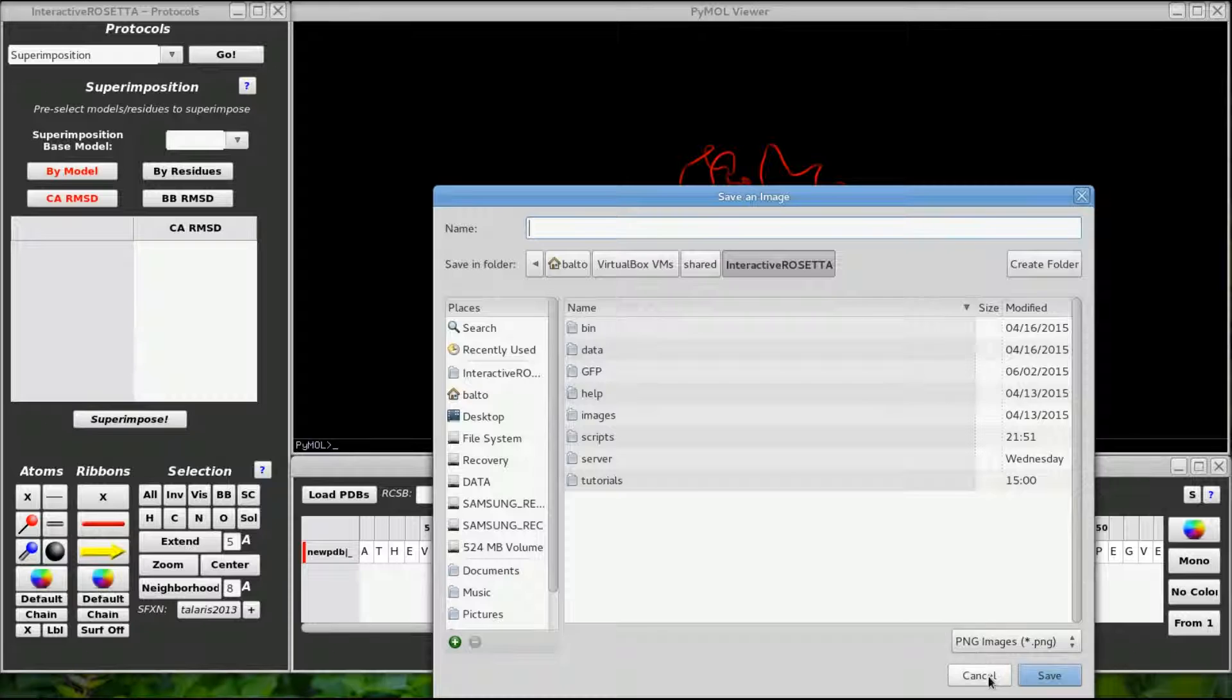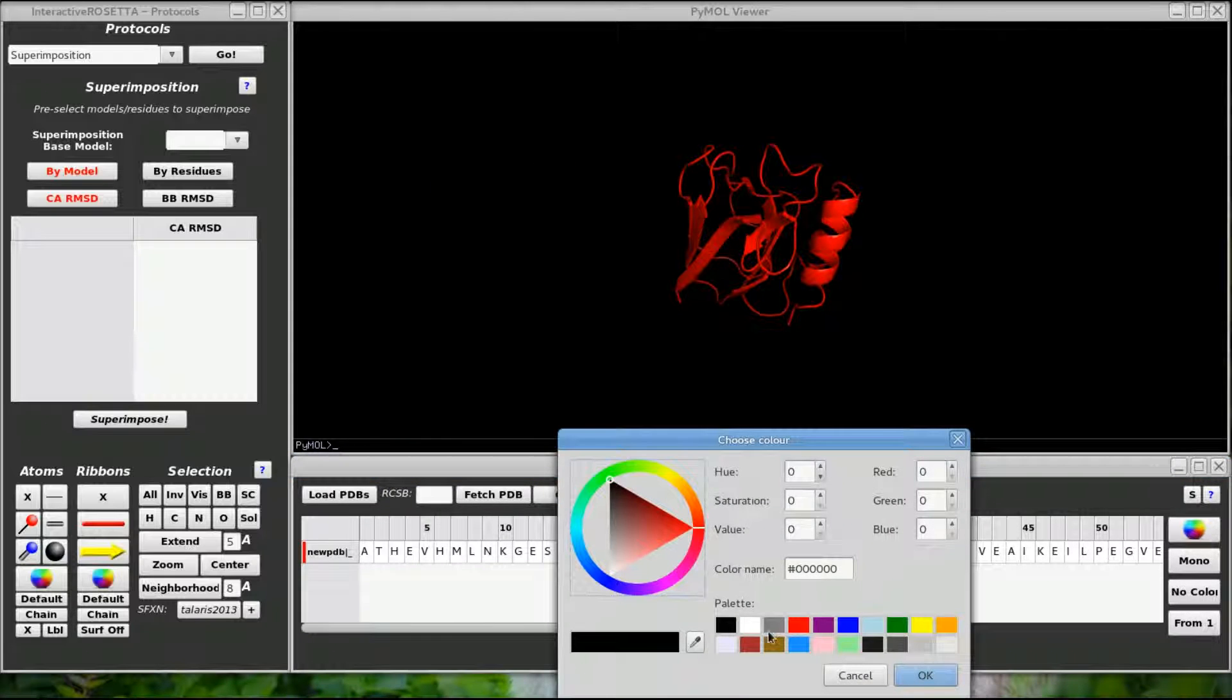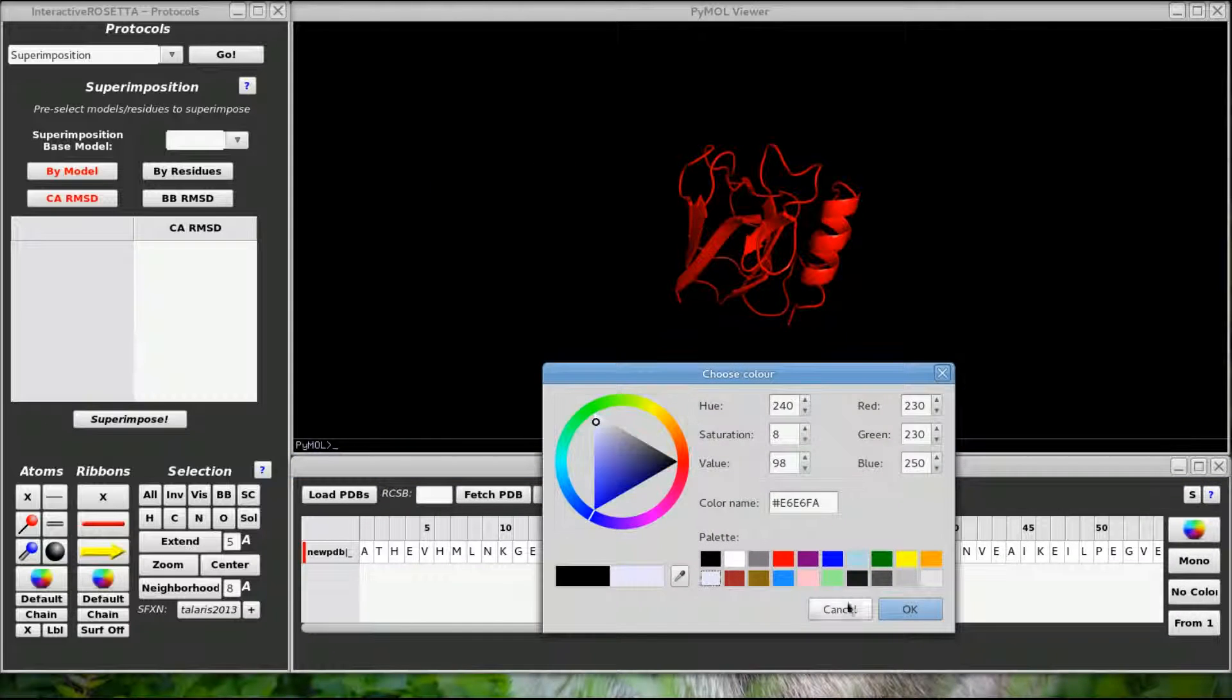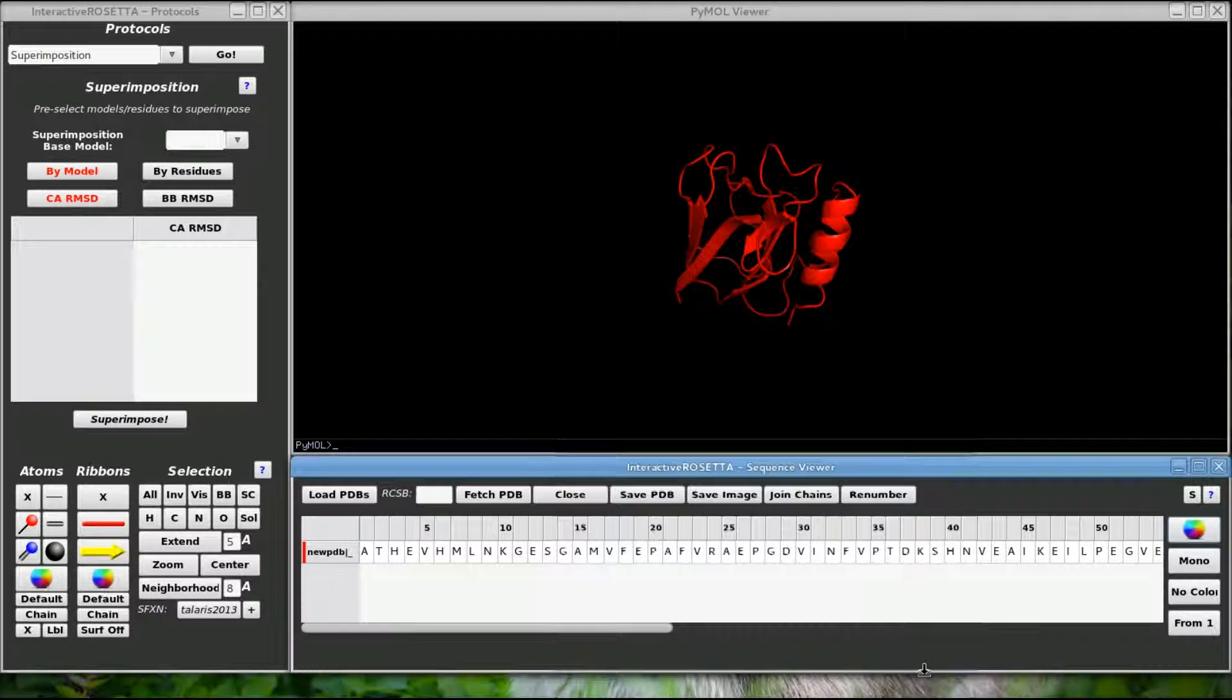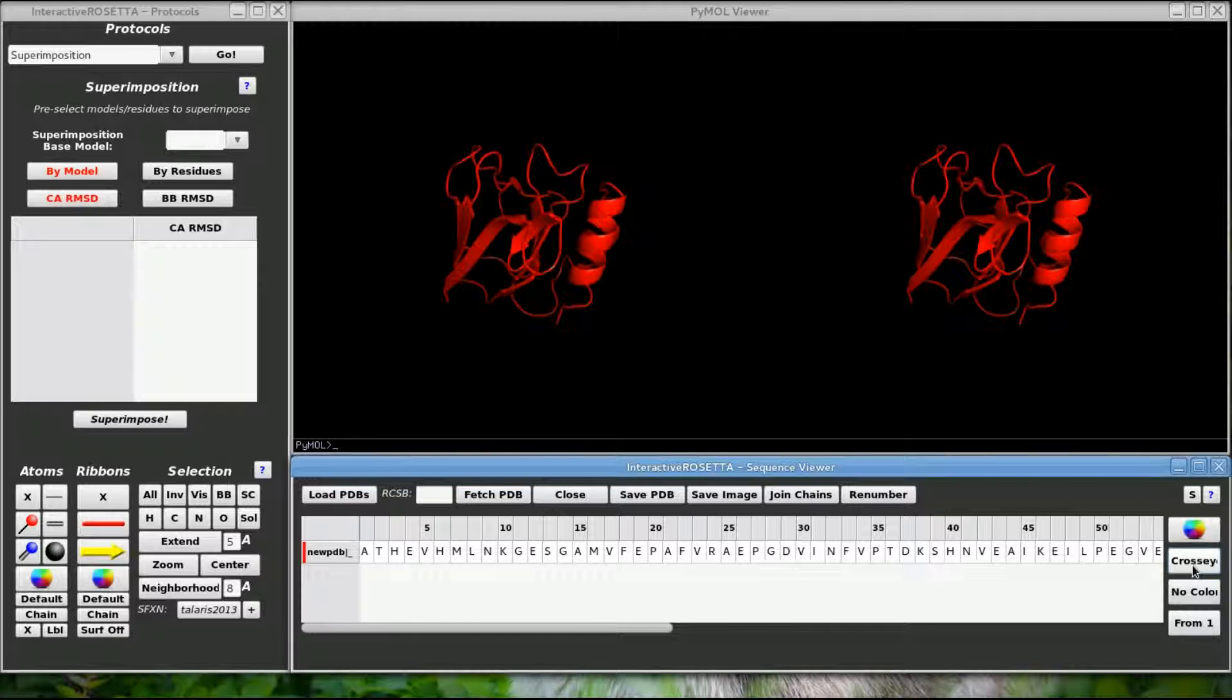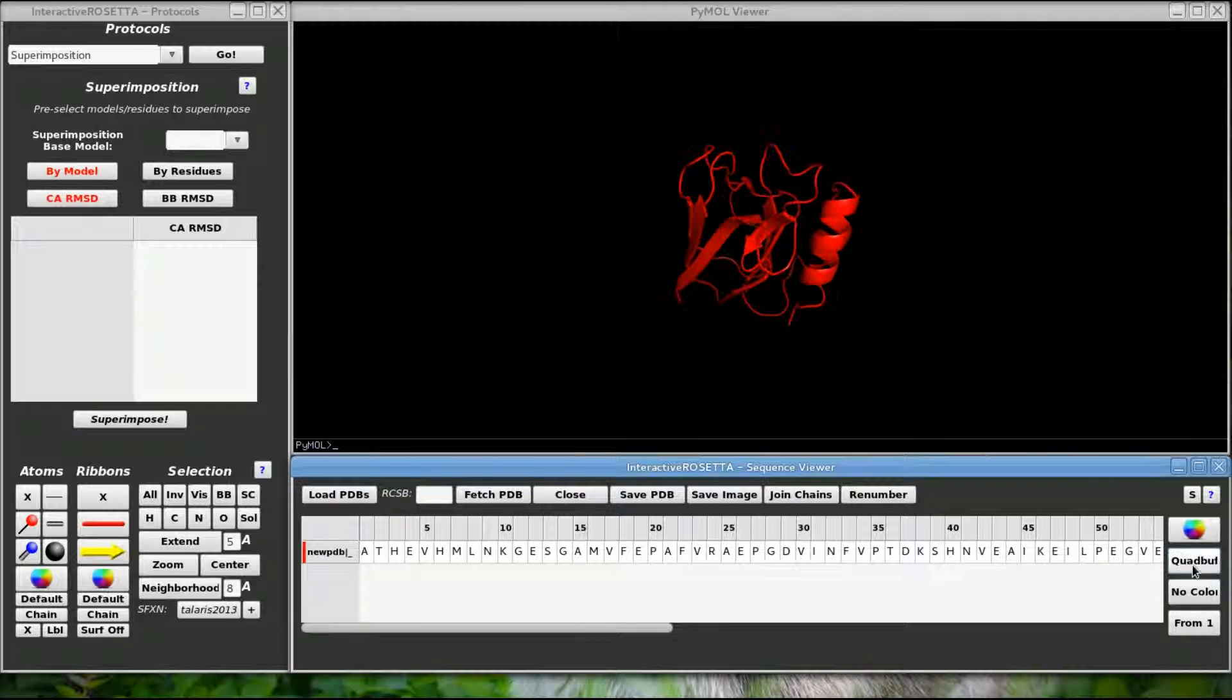The save image button will take a picture of the current view in Pymol and save it to a PNG file. This color will change the Pymol background color. Here is what a white background color looks like. This button is the stereo view toggle button. Some humans like viewing structures in stereo. This does not compute for me since I do not have qualia.